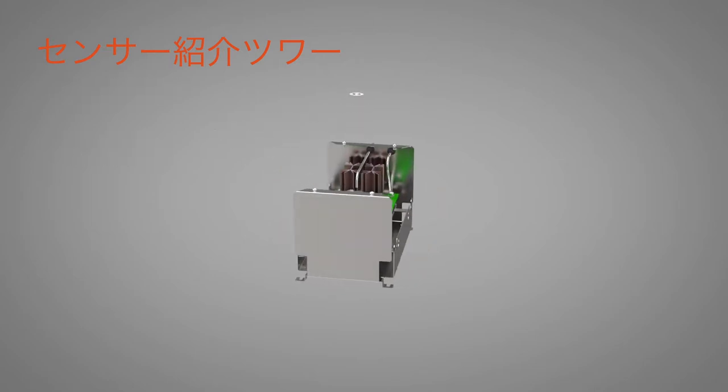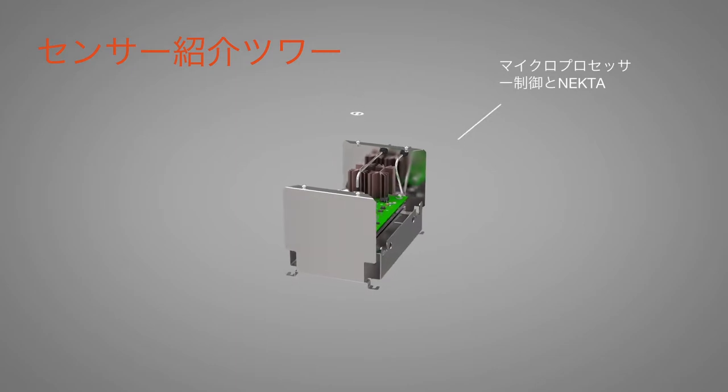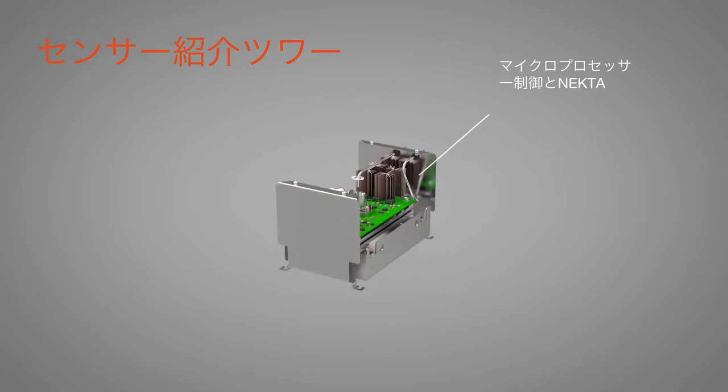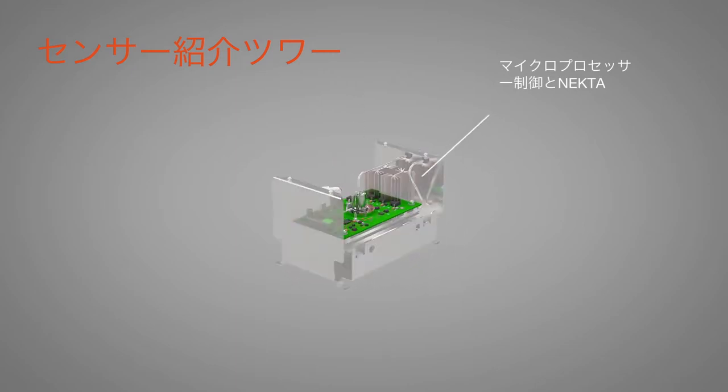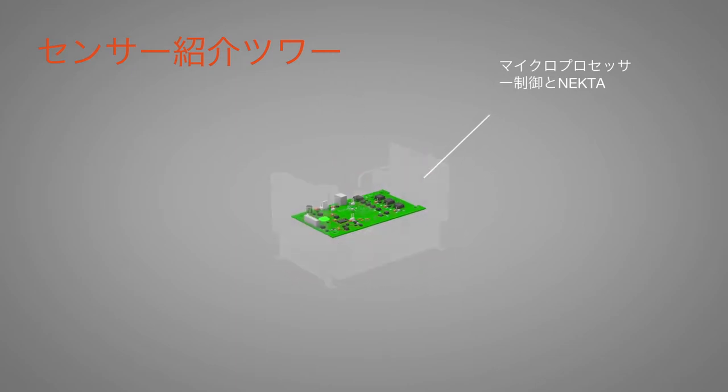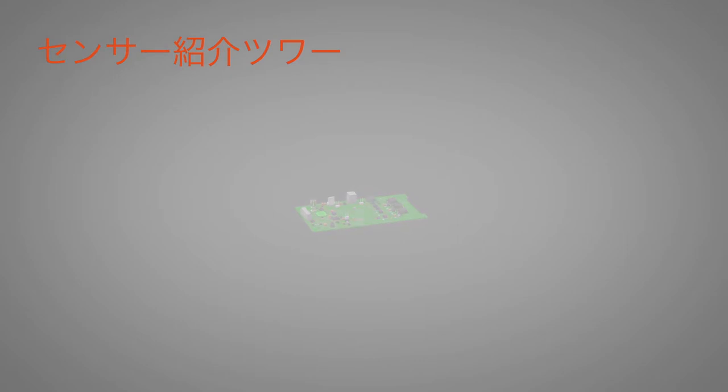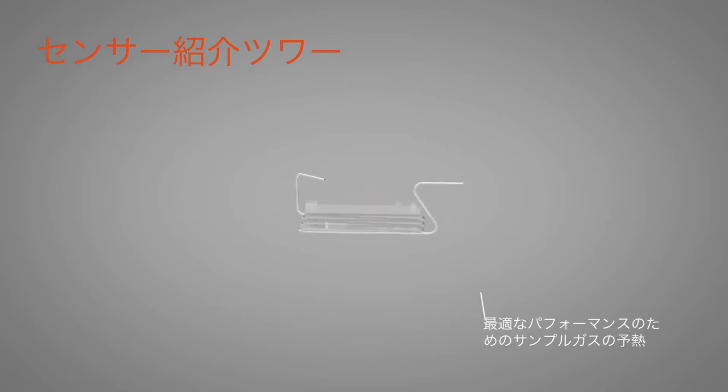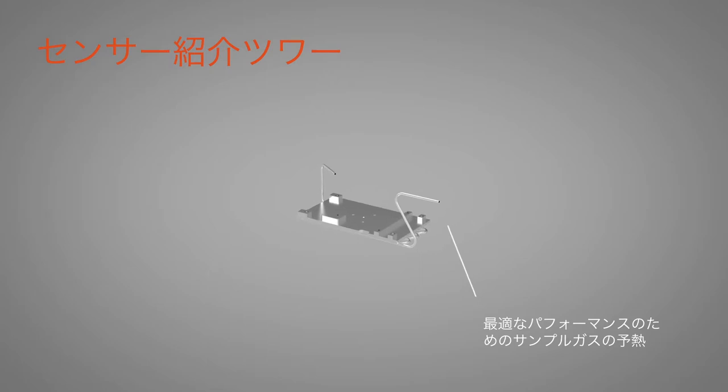It is microprocessor controlled. The sensor also benefits from highly reliable solid-state thick film construction, with the sample gas preheated to further optimize performance.